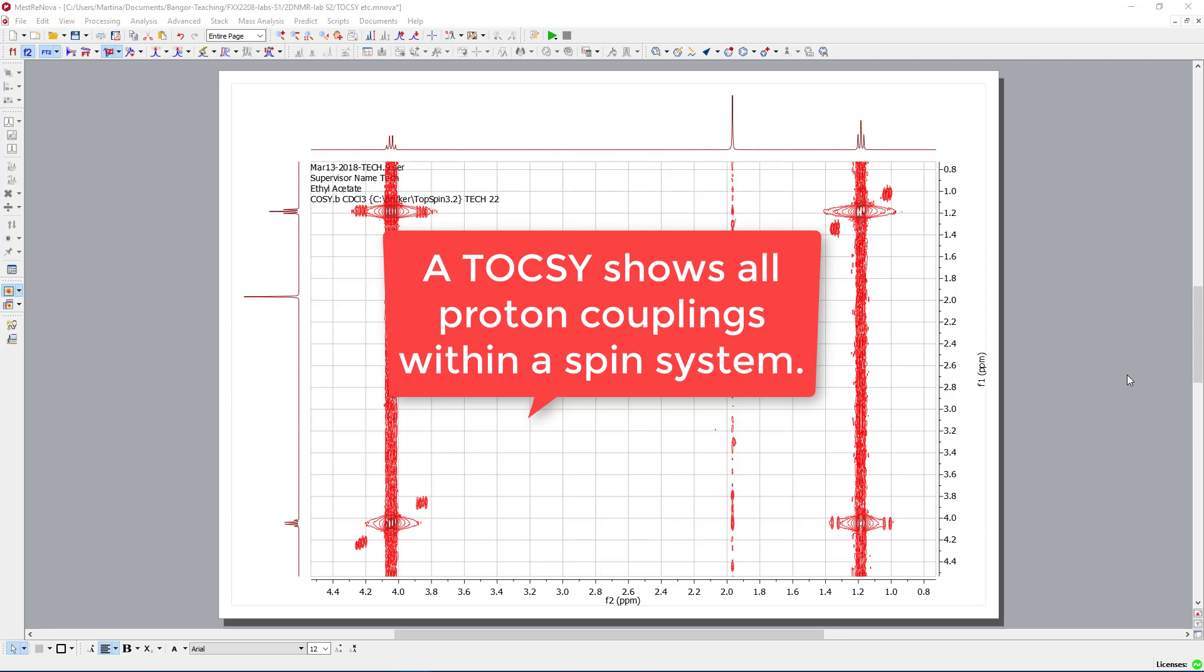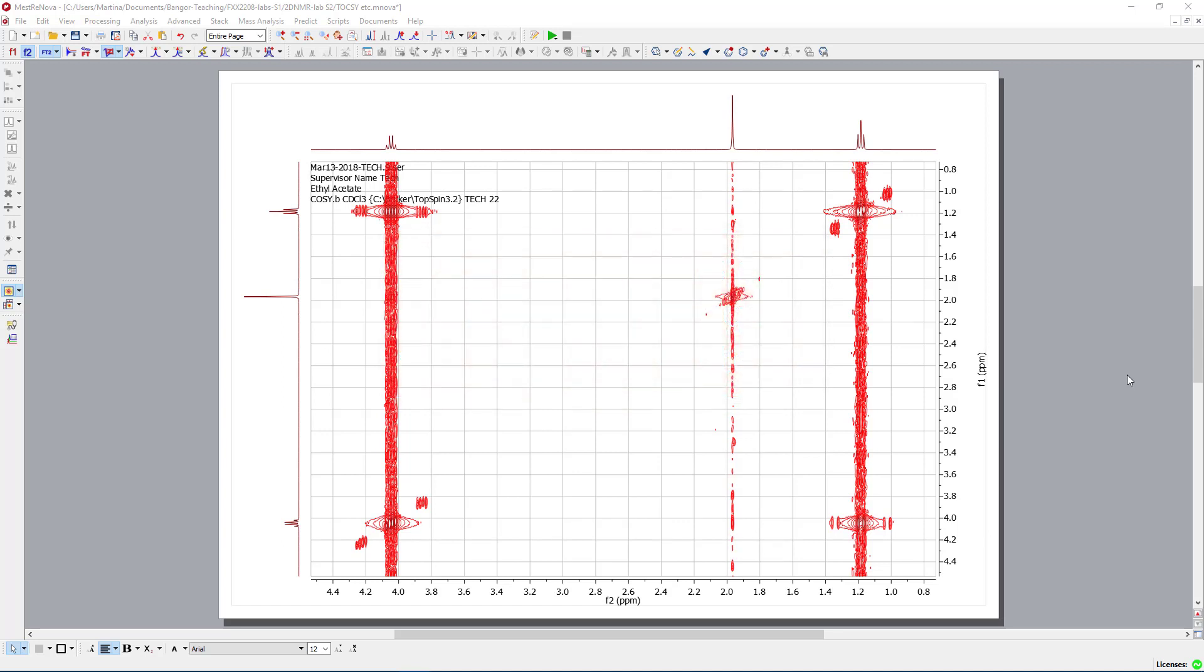This is a very useful technique if you, for example, want to look at peptides, which consist of amino acids. So you would see the correlation within one amino acid and then you would see the correlation between the next amino acid.